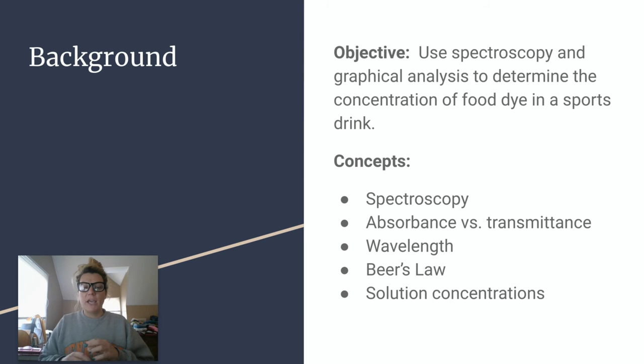The objective is to use spectroscopy and graphical analysis to determine the concentration of food dye in a sports drink. So the concepts we're going to be working with are spectroscopy, which I'm going to talk about, absorbance versus transmittance, wavelength, Beer's law, and solution concentrations.